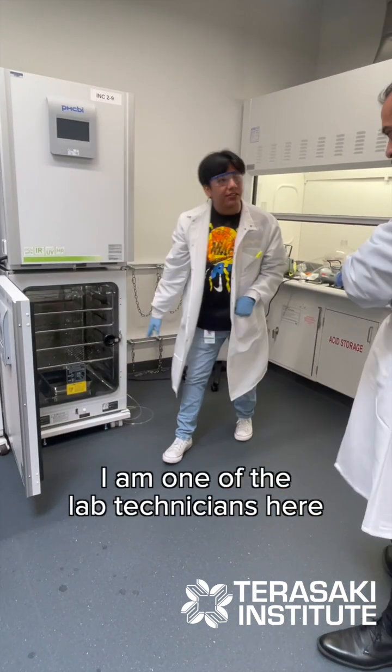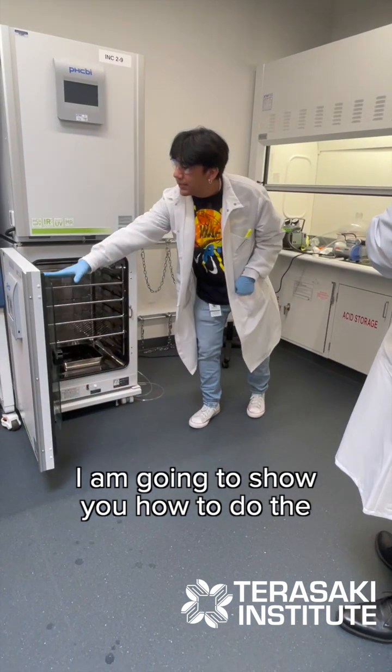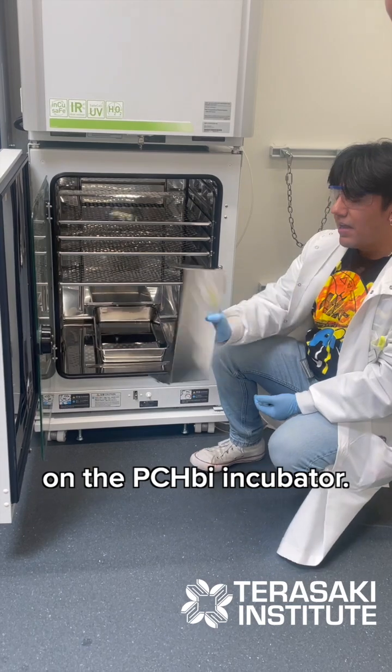Hi, my name is Francisco. I am one of the lab technicians here at Tarasaki, and I'm going to show you how to do the hydrogen peroxide decontamination on the PCHBI incubator.